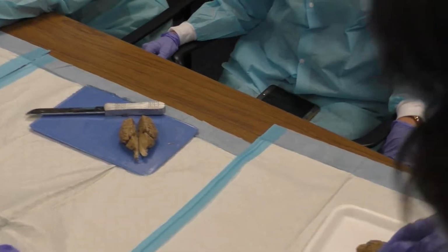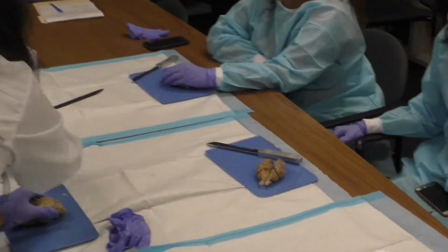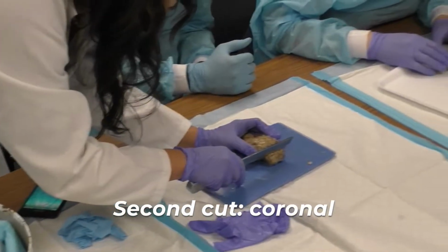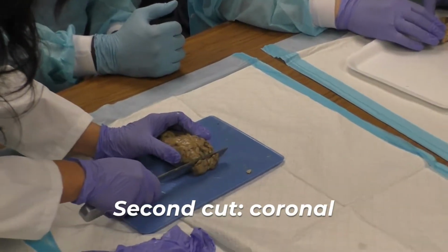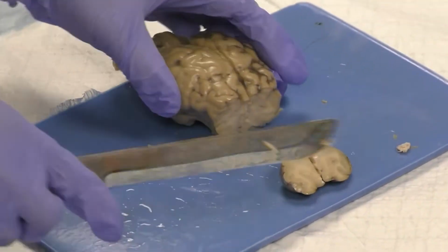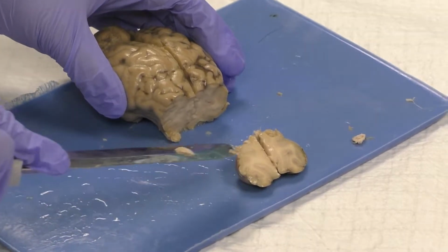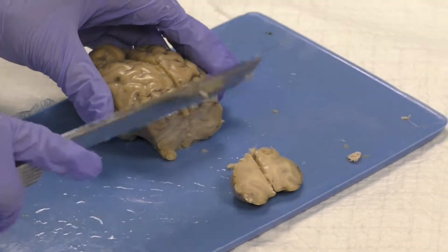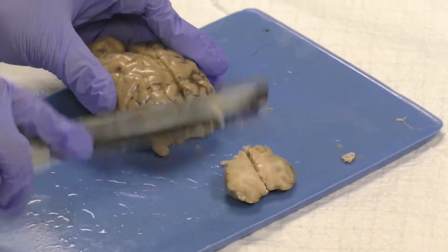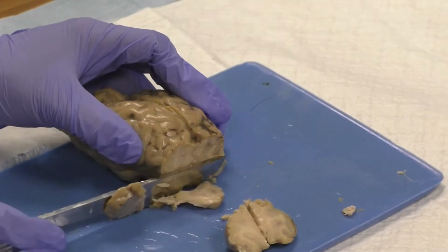I'll do your brain. Okay. So just keep it there. Use the knife. And so I just want to start to cut through the brain. And the cool thing here is that you could really see how invaginated the cortex is, even more from just looking at it at the front. So just trying to, and this is all of the prefrontal cortex in the sheep.